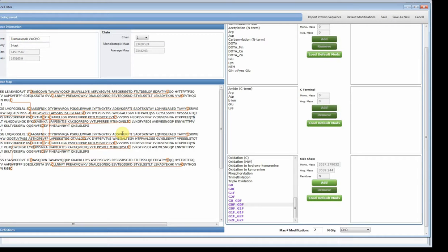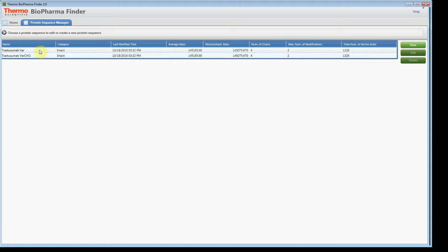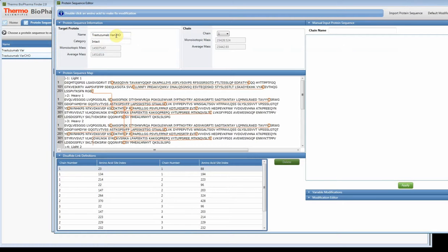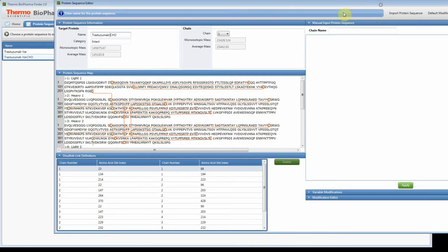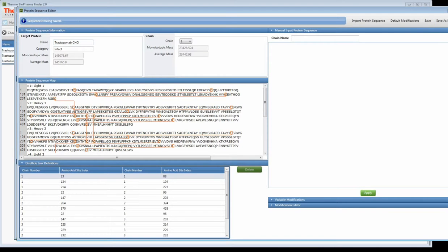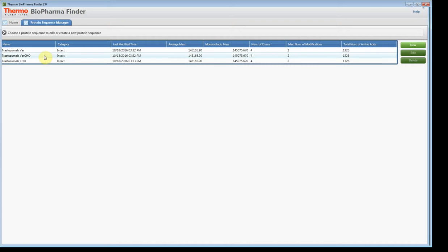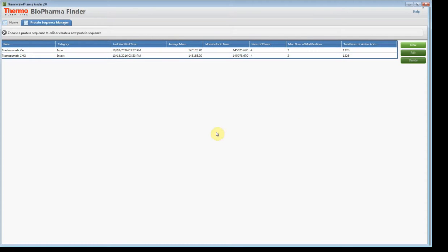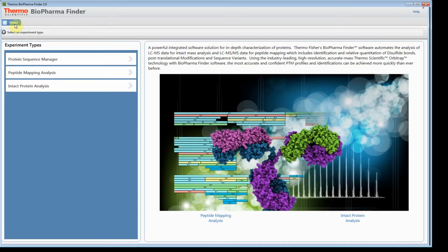Now I have both types of sequences that I can actually search for my deconvoluted results. I notice I left a small error, so let me fix that — get rid of that extra 'variable' and save. I can also delete unwanted entries to keep my database nice and clean. So we now have our two protein sequences. Let's go back to the home and navigate to the intact home page.